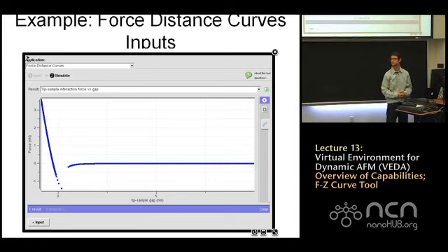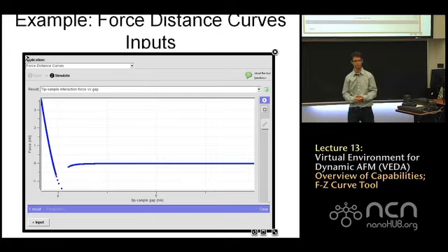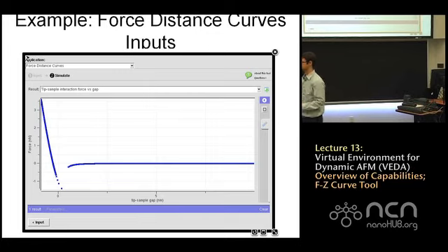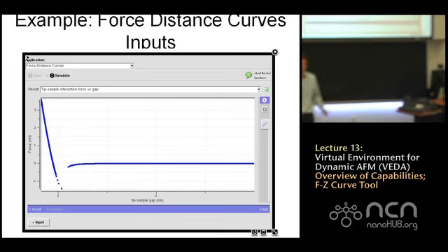Yeah. Okay. And that's simply the reality of the force distance experiment that we do: if we have a snap-in, we're going to be missing some information from our force versus gap curve if we extract that. One thing you might try is to use a stiffer cantilever, which avoids the snap-in, but the challenge with that is that a stiffer cantilever is less sensitive to forces.